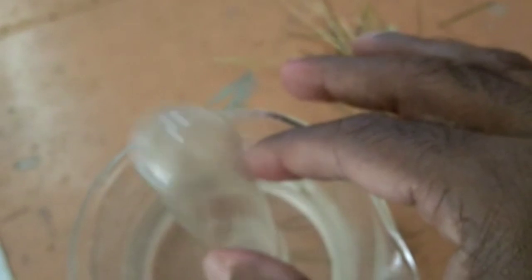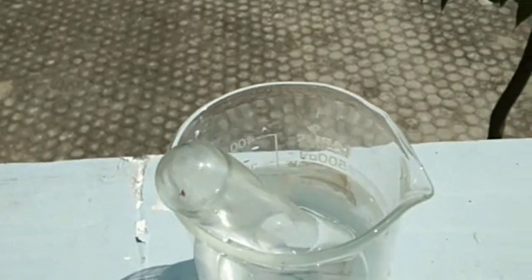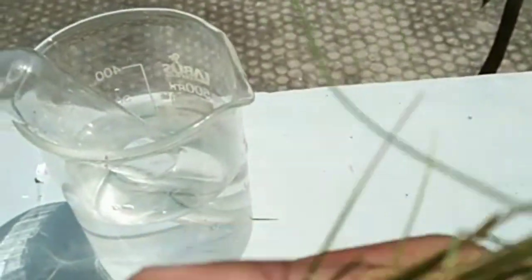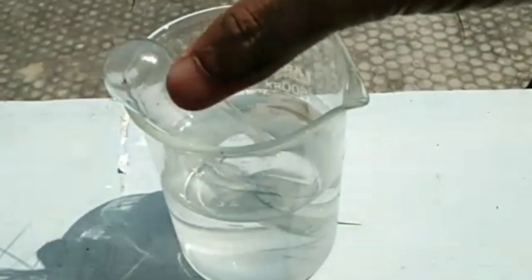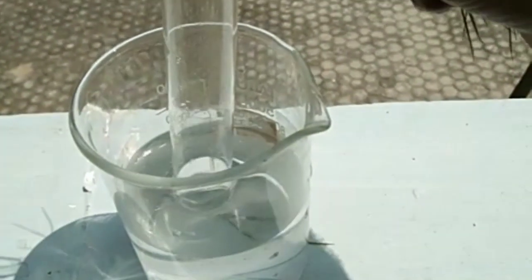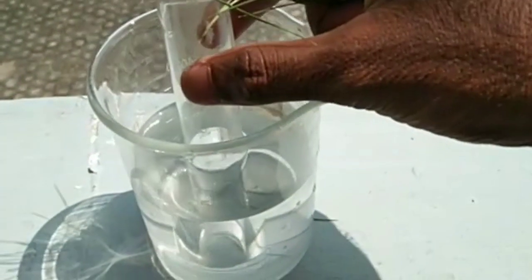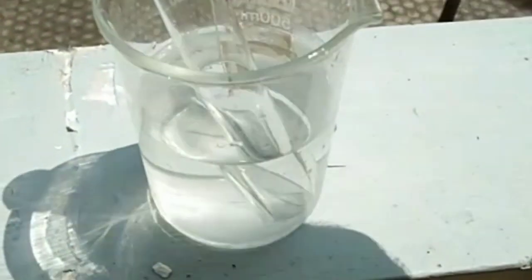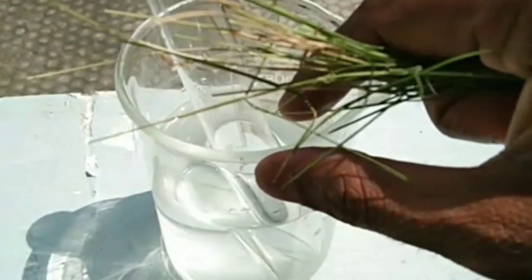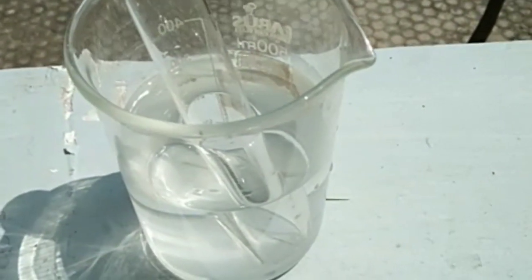After that, I took the grass and kept it inside the funnel. Then fill the beaker with water half or quarter, whatever it is, or limited water. No need to fill it completely.